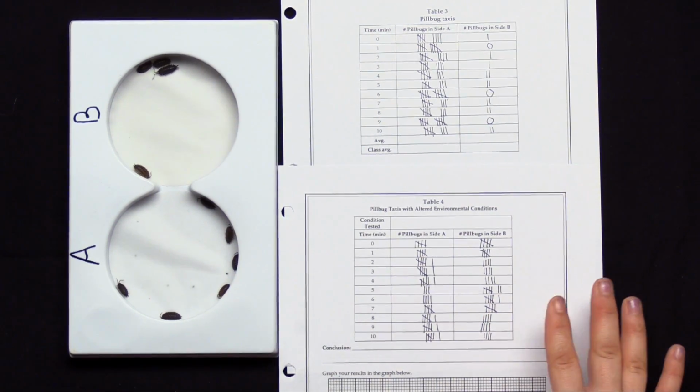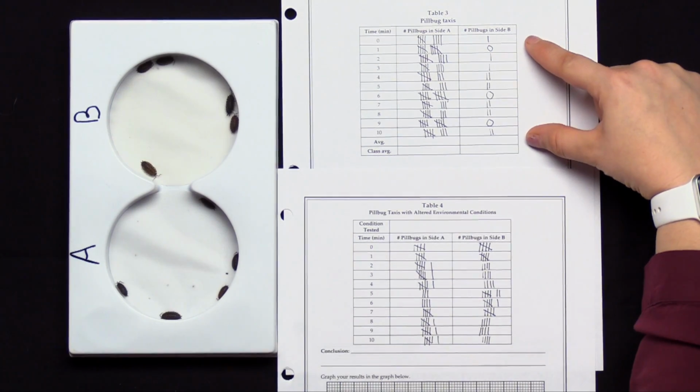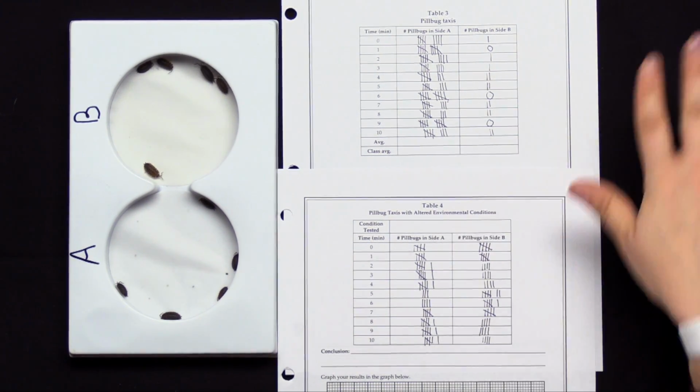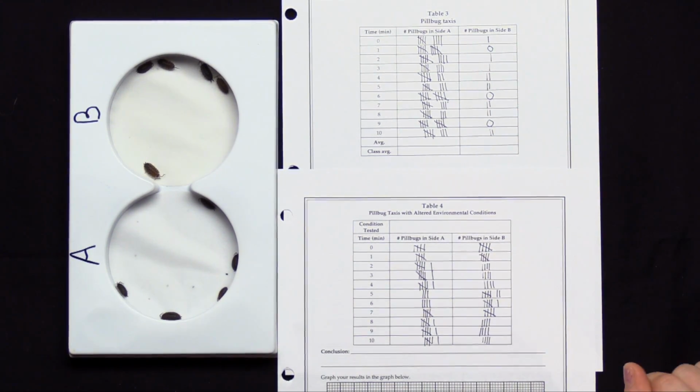As we got into the experiment where we changed the variables, it looks like they did at least tend to prefer side B. Maybe not a 100% preference, because it looks like a couple times they were half and half, 5 and 5. But still, the numbers inside B went up when we added the base as compared to just the normal sort of control situation.